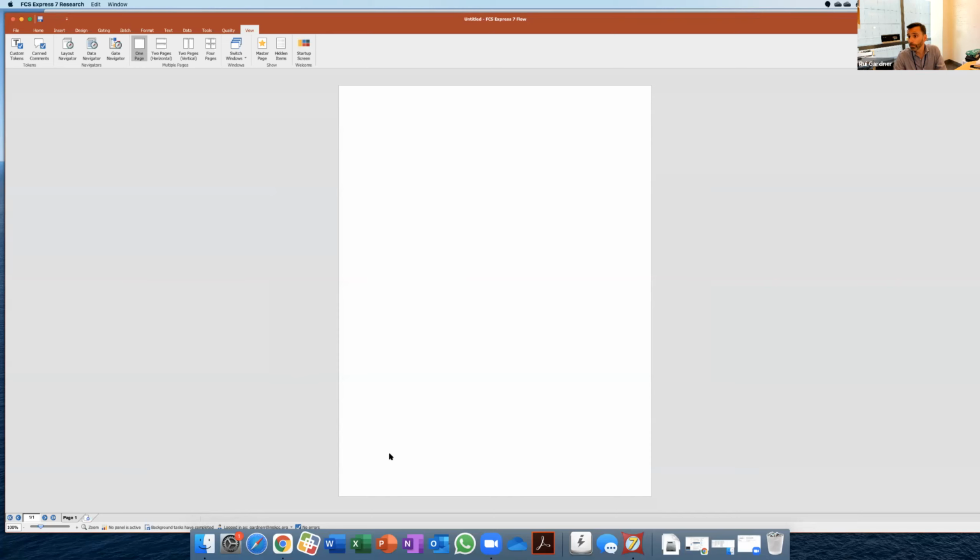Oh, you want to say something, Derek? Yeah, sorry, I was going to ask you a question, Rui. So you're running this on a Mac, obviously. Yes, this, like FlowJo, will run on a Mac or a PC. Exactly. So it runs exactly the same on a PC and the Mac.